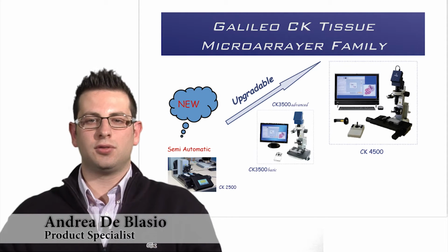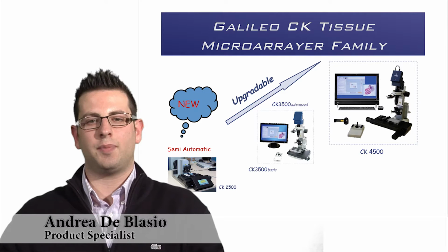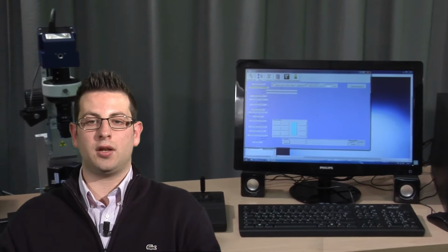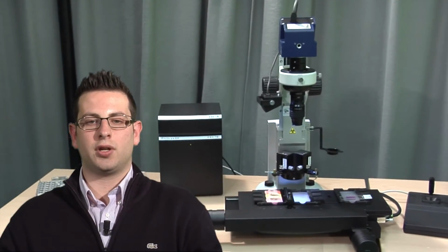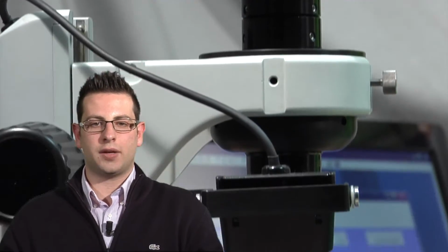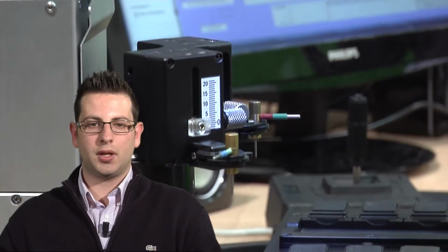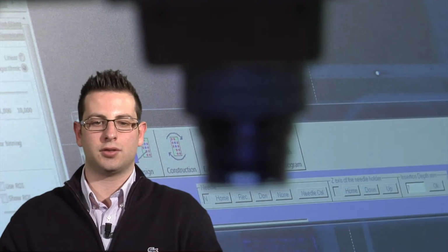We would like to introduce you the new concept of tissue microarray pathology platform, based on the Galileo tissue microarrayer developed by the Integrated System Engineering. The Galileo tissue arrayer was designed with the objective to be the core element of tissue microarray pathology platform, keeping in mind the specificity of research project and diagnostics application.